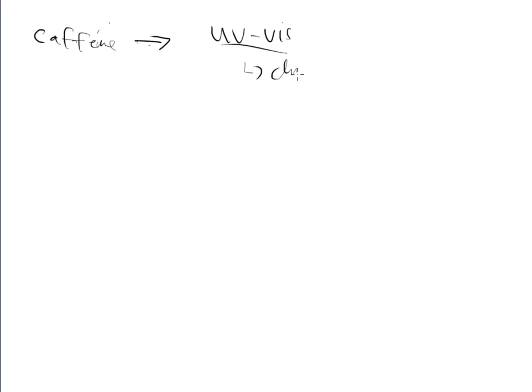So what that means is that this thing probably has some chromophores, and those chromophores are going to contribute to some absorbance values on our instrumentation. This works quite nicely in the UV range because a solution of caffeine is colorless, and that makes me pause and say, if I had to put money on it, it's probably going to be in the range of 200 to 400 nanometers, somewhere in there. And it is, and the lab directions are going to tell you to scan it at a certain point so that way you can determine what that maximum wavelength is going to be.